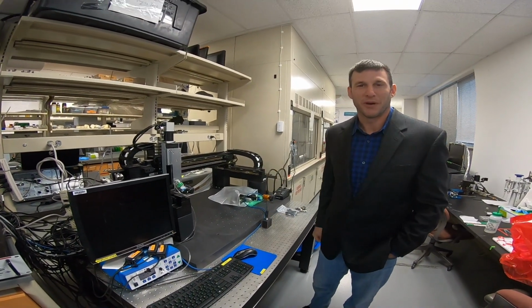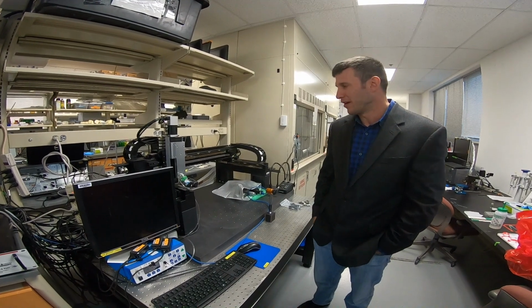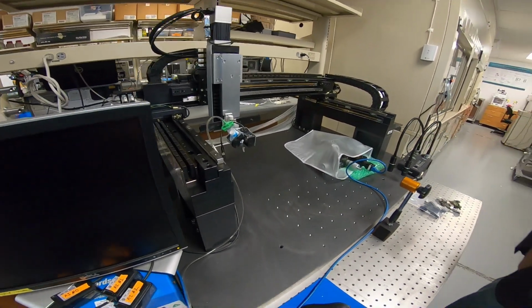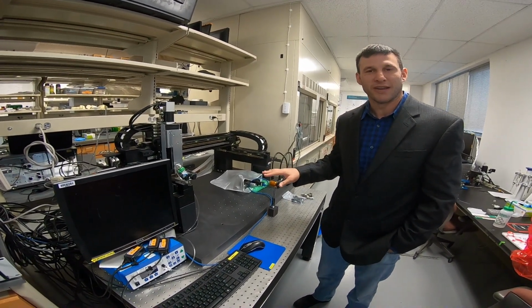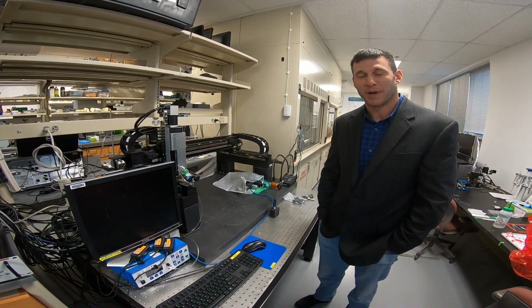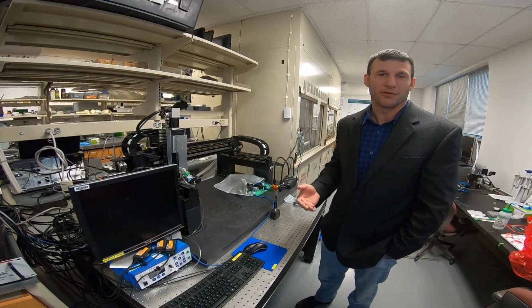So in the Advanced Biomanufacturing and Biosensing Lab, one of the process technologies that we utilize in biomanufacturing now, or we're beginning to utilize more and more, is additive manufacturing processes. So this is a gantry robot that we have in the lab that allows us to do high precision additive biomanufacturing, and we also leverage these robots for automation and primarily for trying to create high throughput methods for characterization of biomaterials and products that are made with biomanufacturing processes.